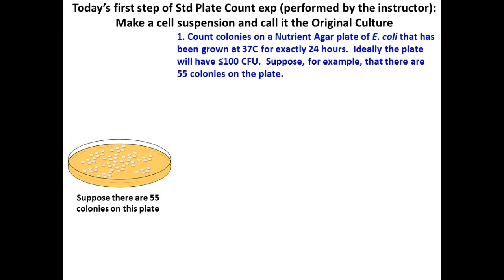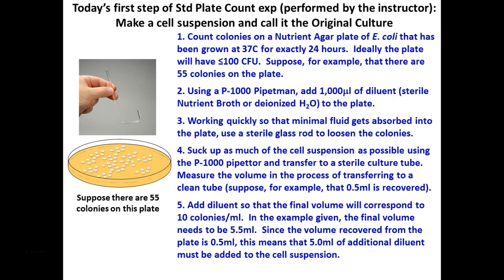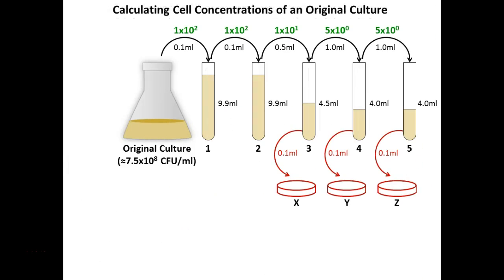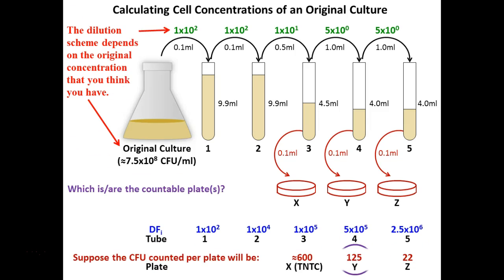This, as I said, goes through the procedure that Peter's been working on, and it would help us calculate about how many cells are in an actual colony. All the steps are the same as the procedure we have, except the starting concentration isn't set up. This is the way he sets up his starting concentration. But this is the dilution scheme.